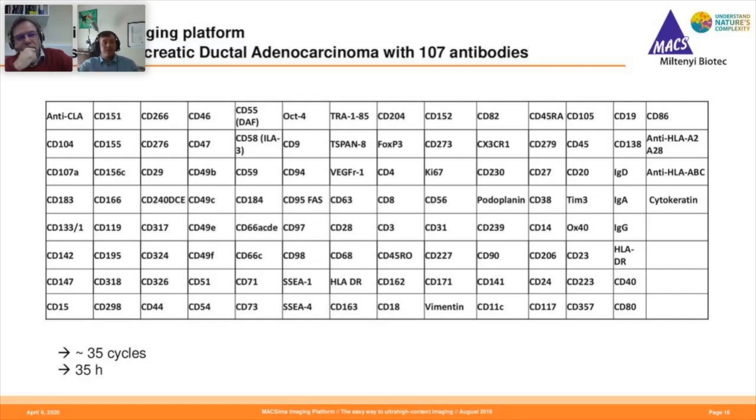Like I said, we use it in other fields for doing cell sorting and things like that, and from what we've seen there, there's not much or no real residue left over, but again, it's really sample dependent, so it's hard to predict that for every single scenario. But when I mentioned earlier the 400 markers from one sample, that was all done with photo bleaching, so they got really nice data, even though all those antibodies were obviously still bound onto their markers. So photo bleaching is clearly a simpler technique to apply, but generally going forwards, do you think release perhaps?